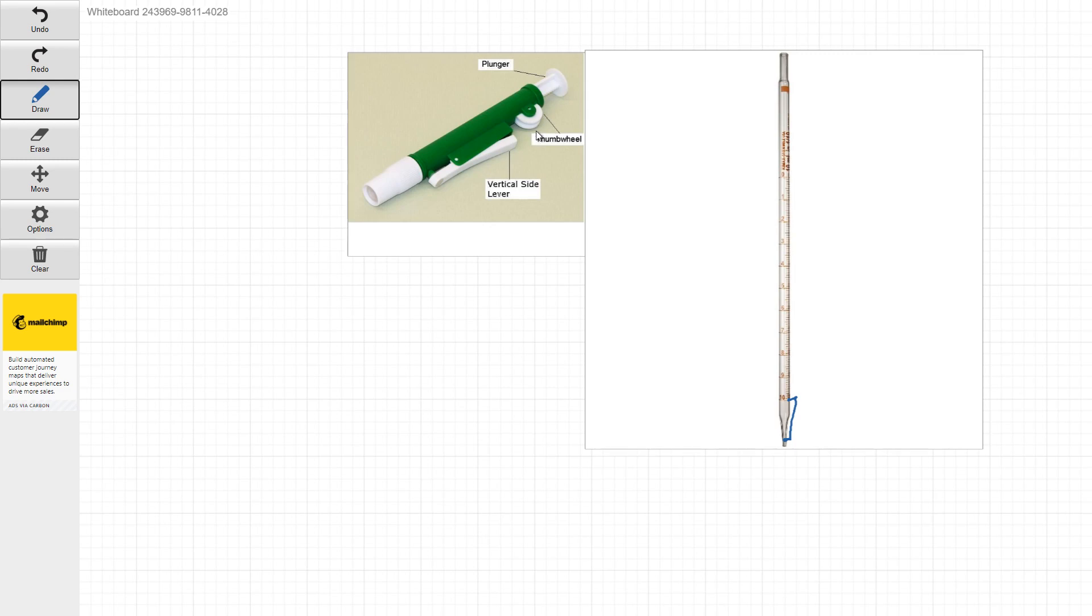So again, you use the thumb wheel to draw liquid up. And then when you're ready to dispense, you can actually press this lever down here and that will start dispensing the liquid.